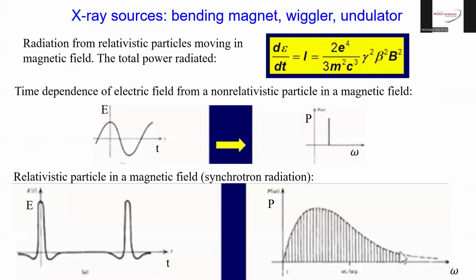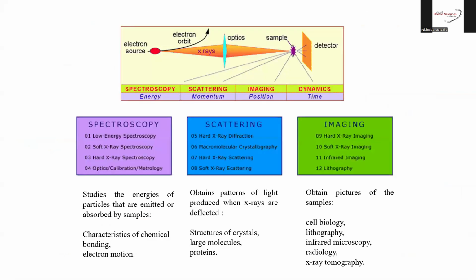Then we send it down the beamline pipe to the sample, but first we need to tune it to a certain energy because we need to use energy scanning. So this is all the mechanics of the X-ray absorption experiment. But there are other techniques such as spectroscopy, scattering and imaging that I'm not covering.